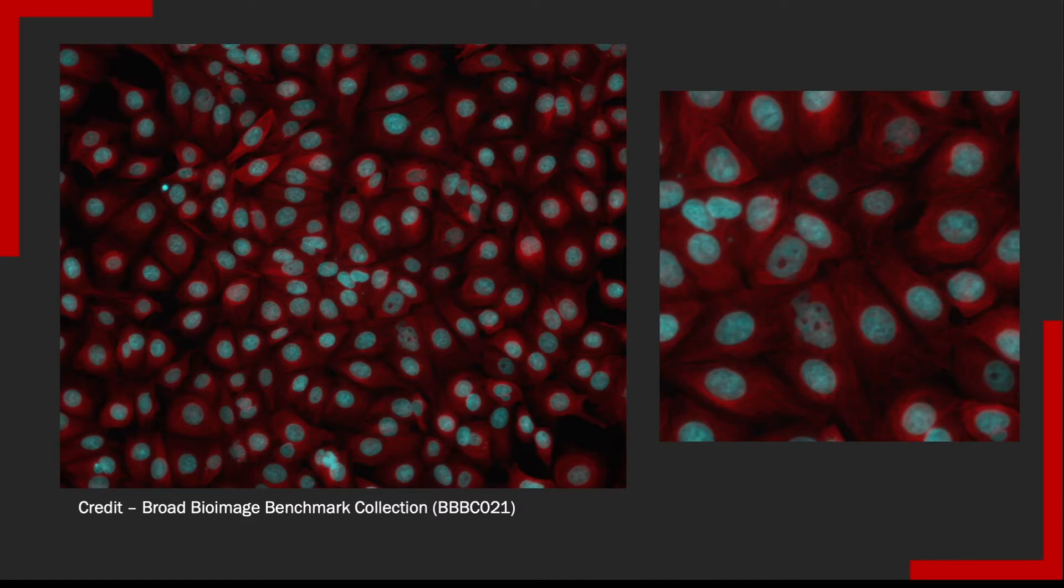Now here's a picture of some cells after we add something that hurts their genes and causes what we call DNA damage. The nucleus now looks much bigger and that some of the cells and the nuclei have some holes in them. Overall though, they look kind of the same.